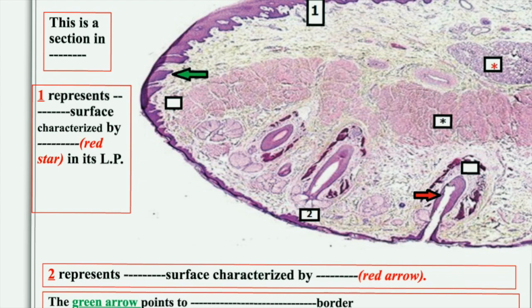In slide five: number one represents the inner surface of the lip, or mucous membrane side, characterized by the labial glands. Number two represents the outer surface or skin surface, characterized by the hair follicle. The green arrow points to the vermilion border, and the black star denotes the skeletal muscle orbicularis oris.